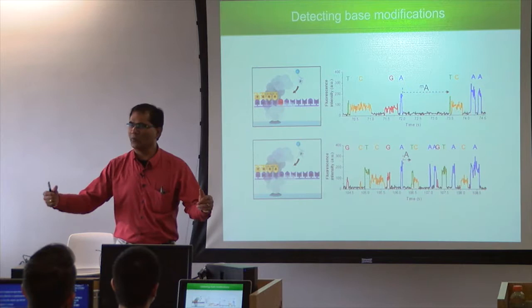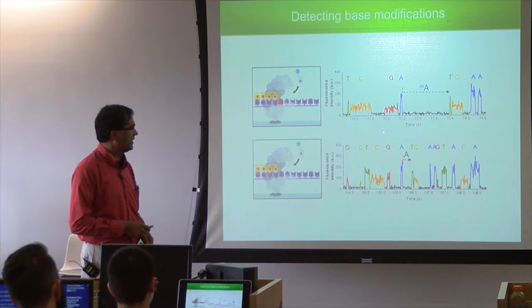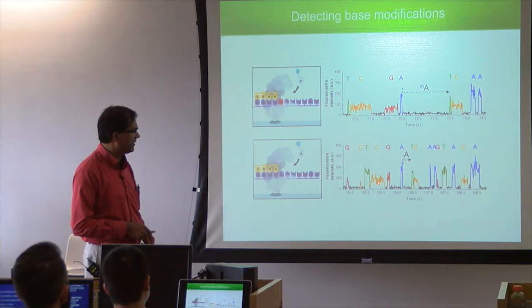Okay? So this is the enzyme kinetics you are following here. So what can we make use of that polymerase kinetics? How do we make use of that? See, there is a polymerase kinetics, right? When you do the polymerase kinetics, you know the time interval of addition of the ATGC bases.